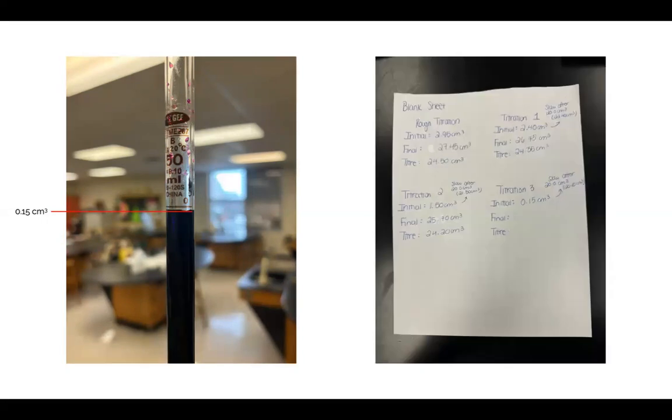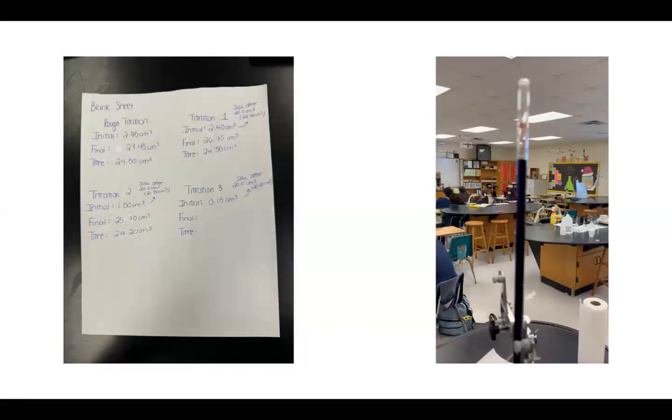Again, remember before continuing, you have to clean out the conical flask and add more of FA1 and FA3 to the flask. So we're going to write this 0.15 centimeters cubed in our titration 3 initial volume. And we know that we have to slow down after around 20 centimeters cubed thanks to our rough titration. And that will be around 20.15 centimeters cubed. When it shows that on the burette, we'll slow down and go drop by drop.